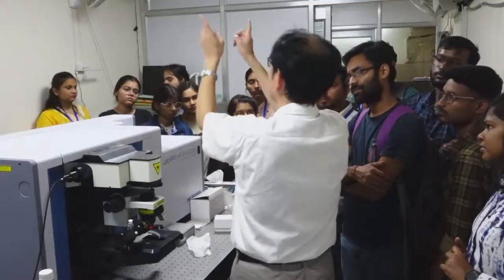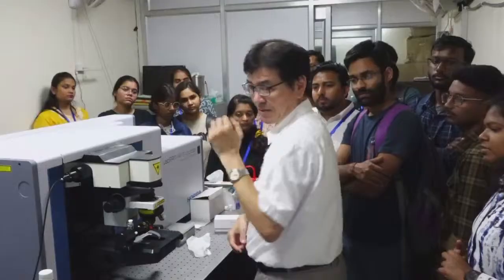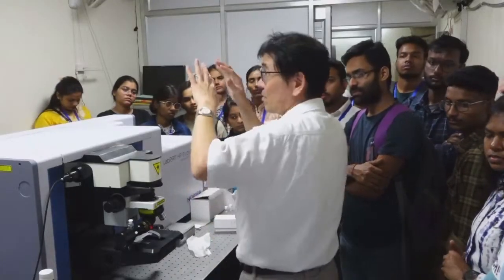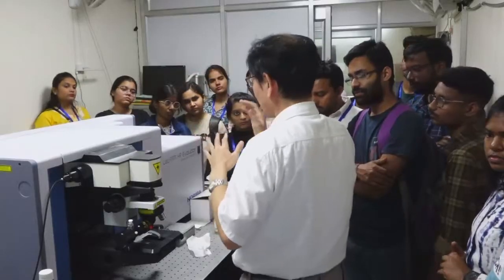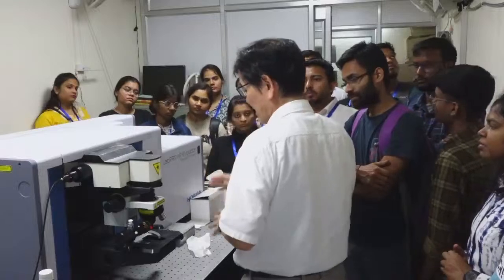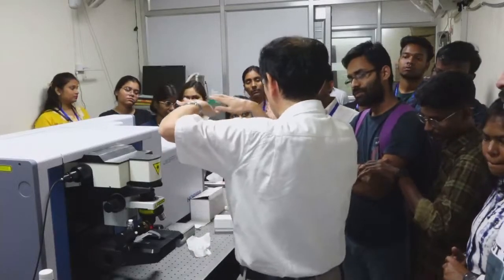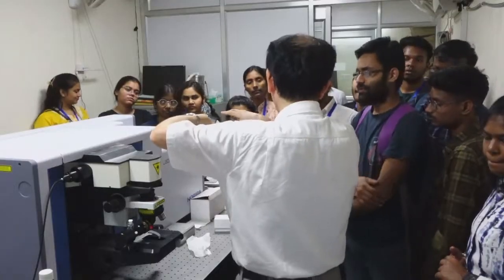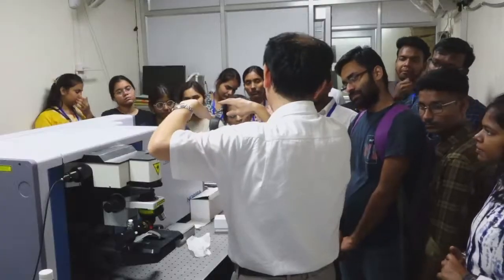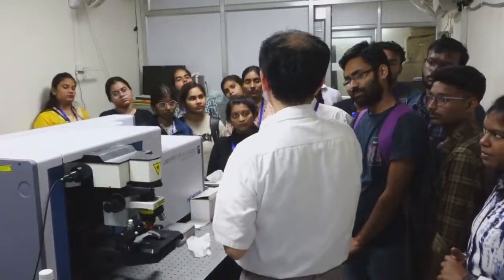For example, room light or some display light. By turning off and shutting out all the stray light, and doing the experiment carefully, the baseline becomes lower and lower. And ideally it should be flat. But that's it.